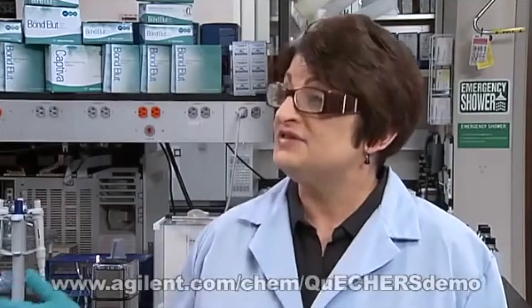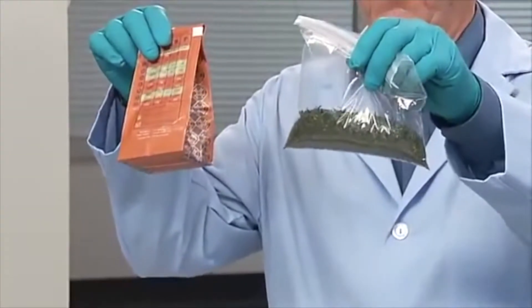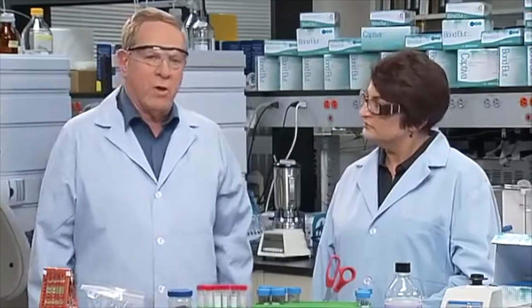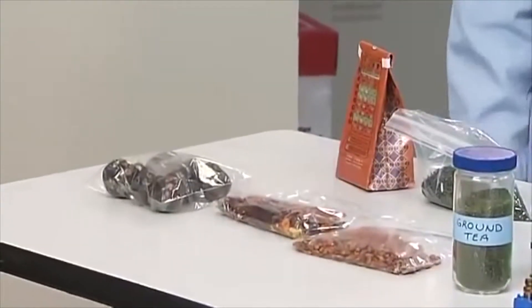If the sample is a dry sample, can we skip the chopping and grinding? It really depends. If the sample is dry and finely divided, like flour or spices, then we can skip the chopping and grinding. If the sample is dry and leafy, sort of like these tea samples, for example, we can skip the chopping and go straight to the grinding step. For whole dried material, such as these dried peppers, we have to chop and grind the sample.